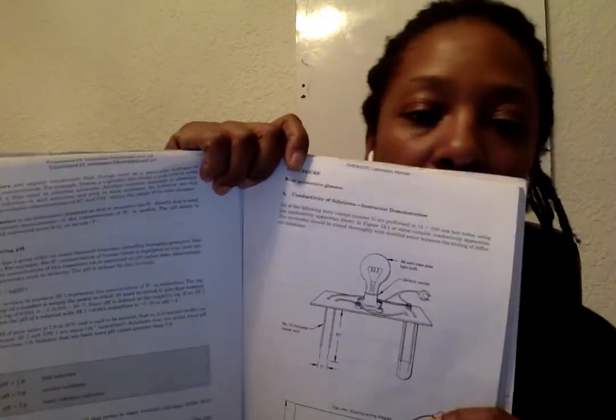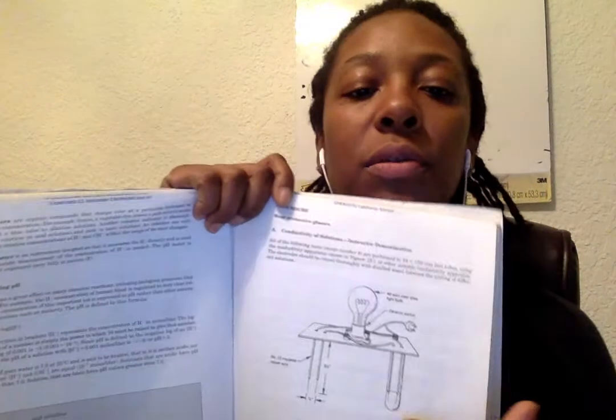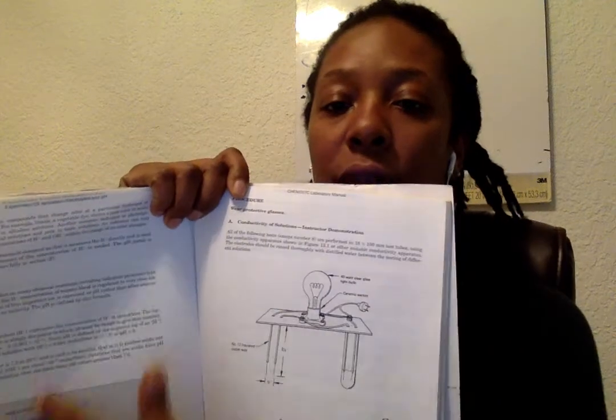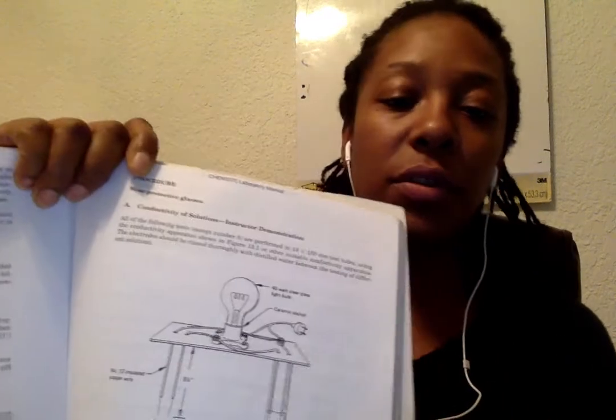And all you need to do is indicate whether it's a non-electrolyte, strong electrolyte, or weak electrolyte. Okay, so for instance, a weak electrolyte is going to be displayed as a dim light bulb. So the procedure will be her setting up this apparatus, and at the bottom here is where she's going to be dipping these rods into different solutions. Those 12 solutions are all that whole page of solutions, and each one of the solutions will show a strong, weak, or non-electrolyte.